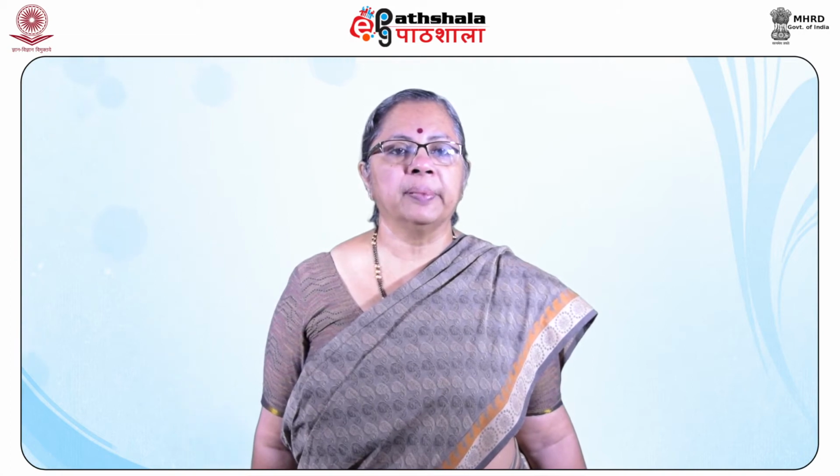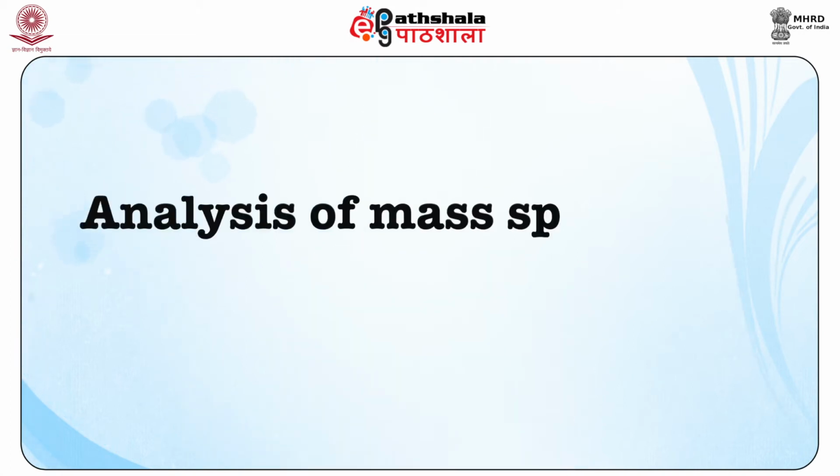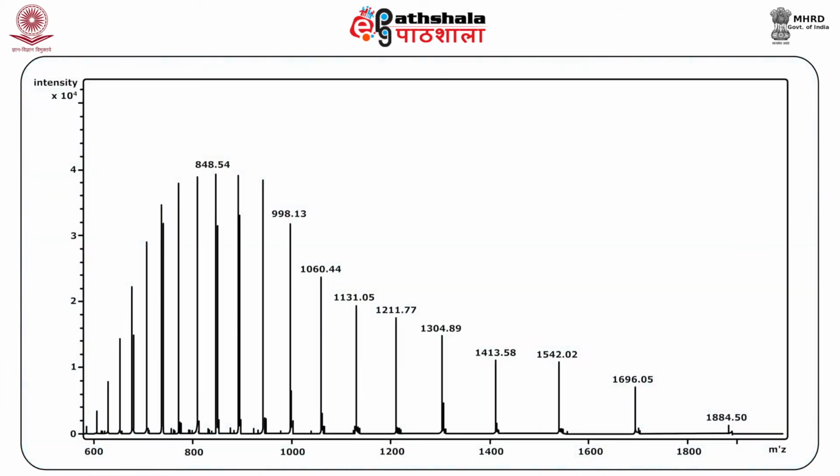Peptides and polypeptides of mass around 400 kilodaltons have been analyzed by MALDI. The matrix such as gentisic acid is a UV absorbing weak organic acid which also acts as a proton donor to the peptide. How do we analyze a mass spectrum? In the indicated spectrum, the rightmost peak would correspond to the ion with the lowest charge, therefore highest m/z ratio.